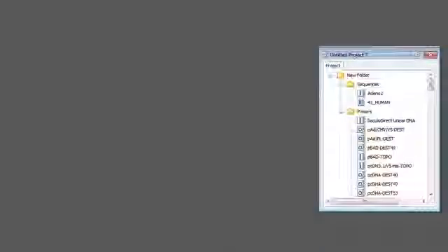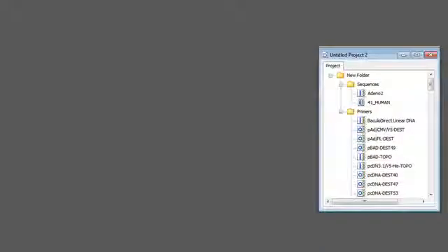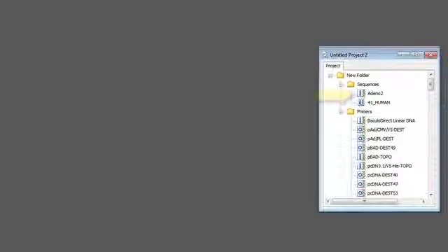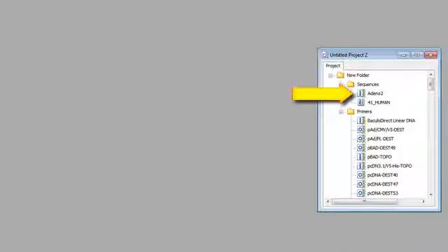Once I've imported my sequences, I can open them in the Document window. Here, I'll open the GenBank DNA sequence named Adeno2 by double-clicking on it.